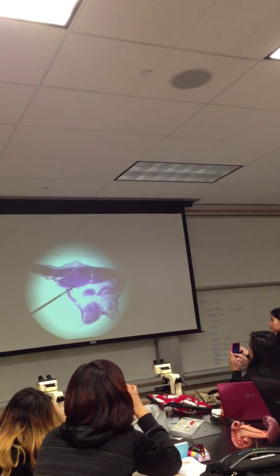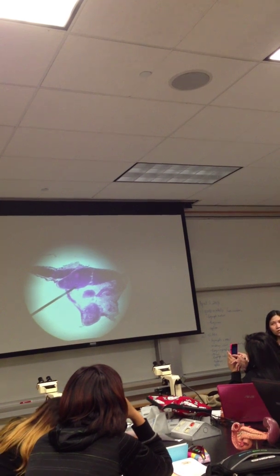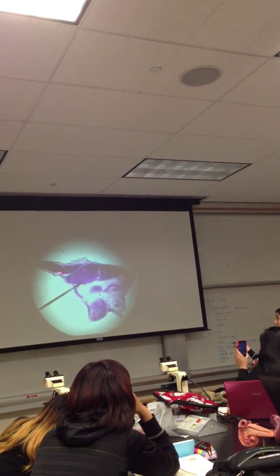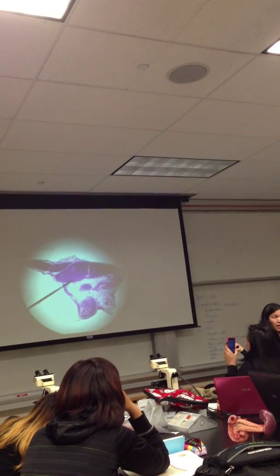What is this? Remember the septations, the one that I showed you in lecture earlier, the ones that have the lobules, and they have clear, distinct lines? So far, we haven't seen anything like that. Plus it also has a capsule, so this will be an organ, not just a tissue. And this is the thymus.